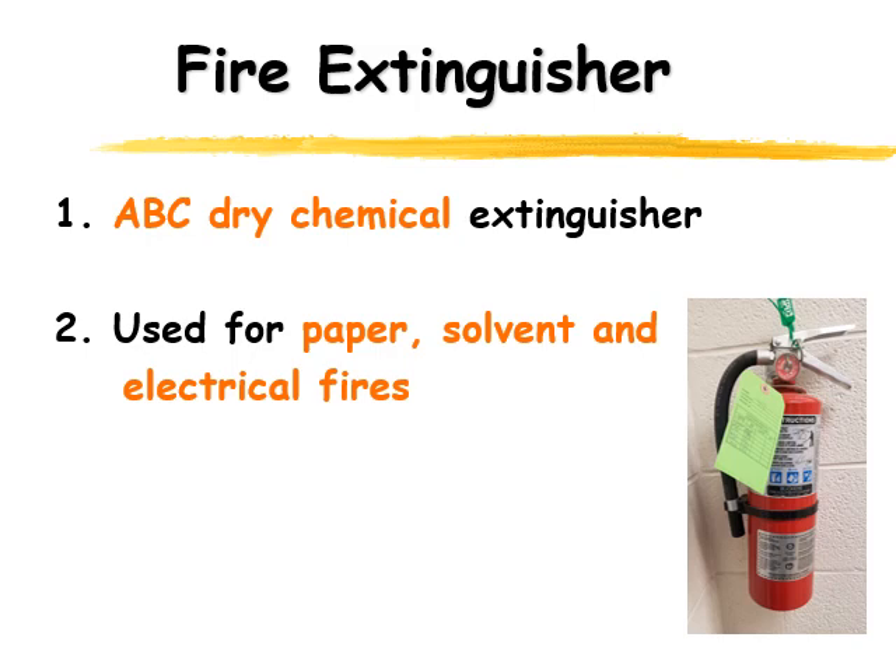You can see the little green tag on the fire extinguisher — that shows you that it's inspected regularly. They come around, check the pressure, and make sure that if there is a fire, the fire extinguisher is ready to put it out.